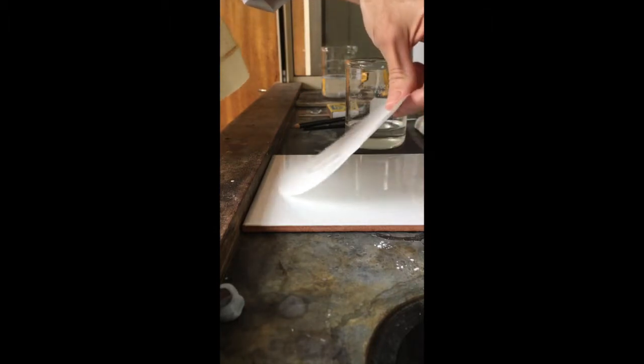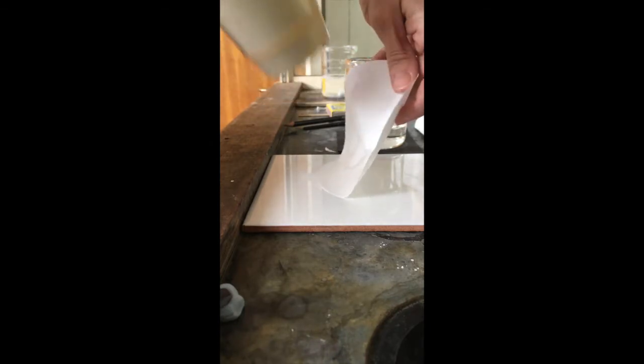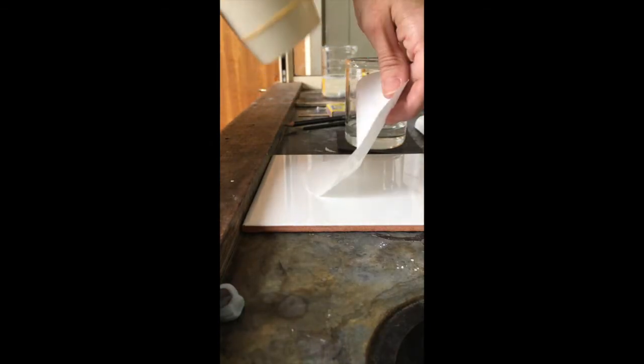Now use a hairdryer to thoroughly dry the filter paper. You do not want to see any moisture left on the filter paper. Don't scrimp on this bit.